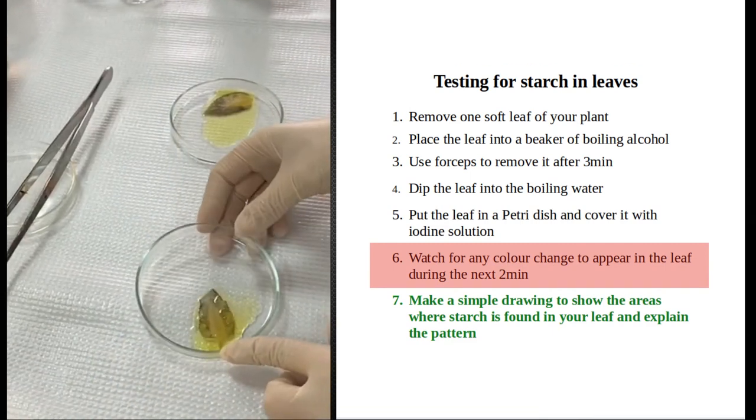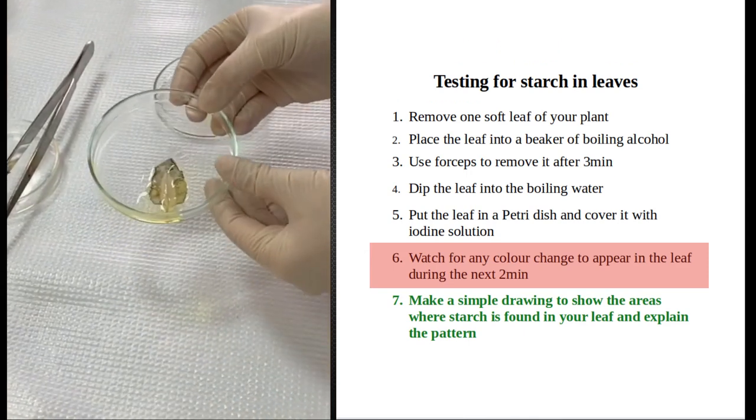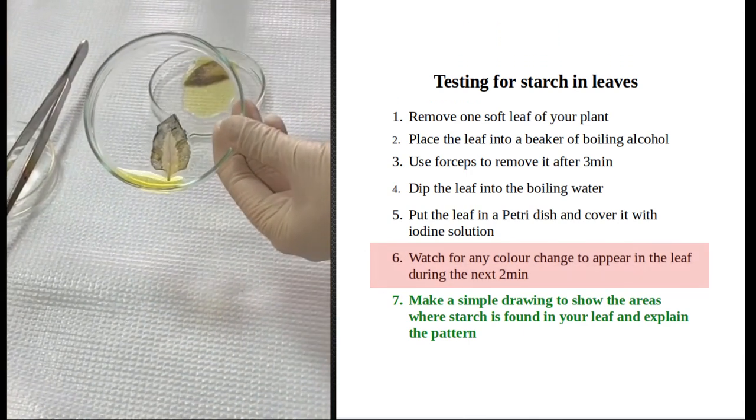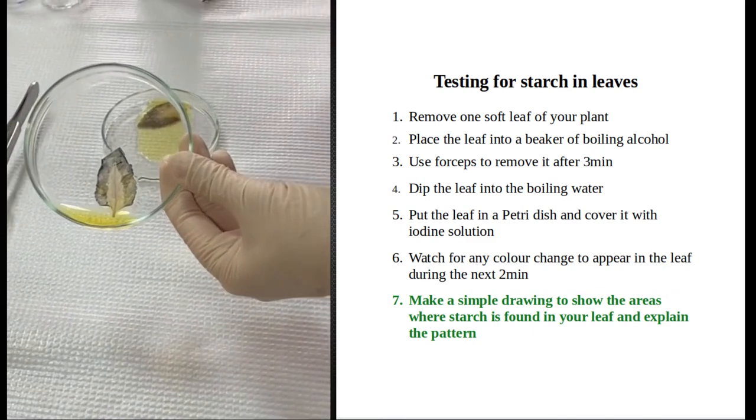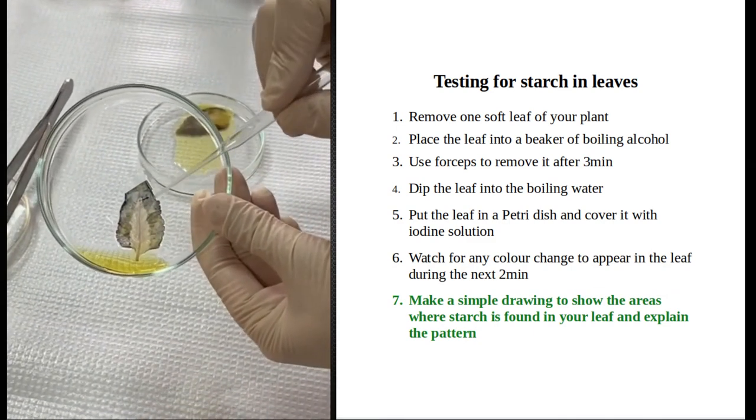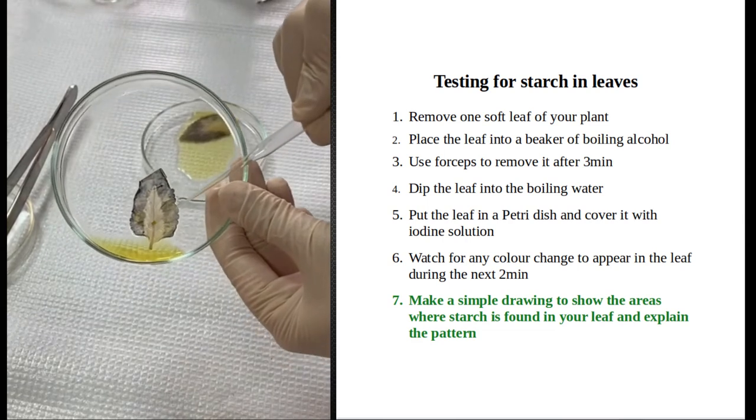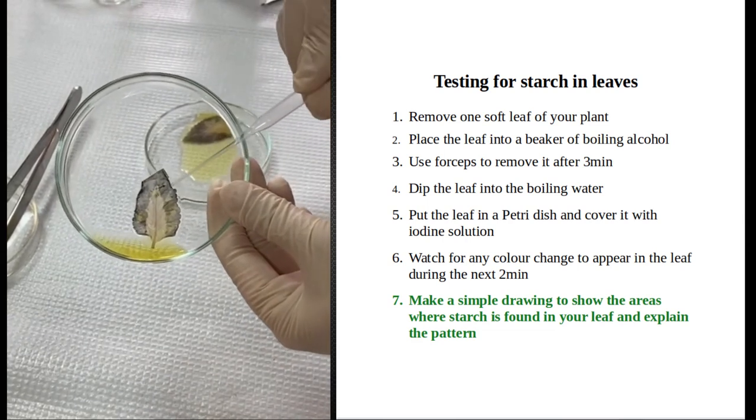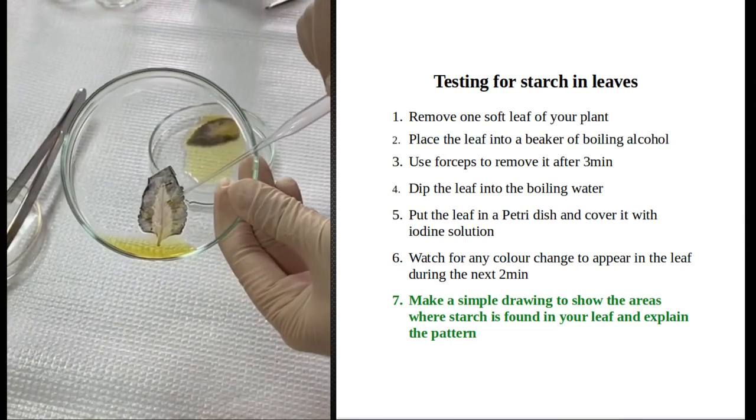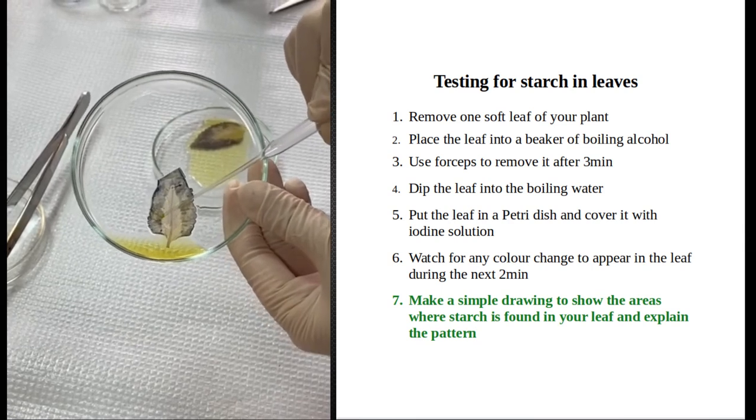The results of this leaf start becoming clear. You can see it on the white background now. This is the area that was green, that had chlorophyll, and this is the middle that was white and purple where there was no chlorophyll.